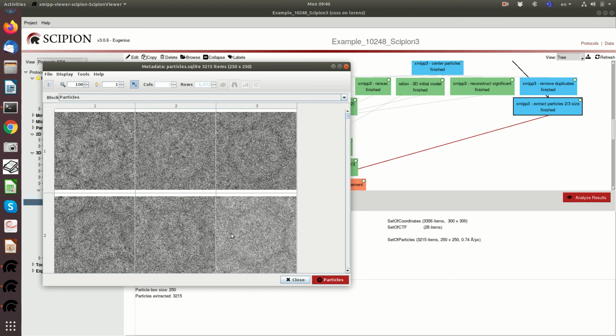For that you need 3 angles and 2 shifts, or however you want to encode those parameters, but at least you need 5 numbers, and you have an extremely noisy environment in which you barely see anything in the particles. So all these numbers are subject to very high noise. When you have a noisy environment, you have noisy data, your estimates of parameters are also noisy.